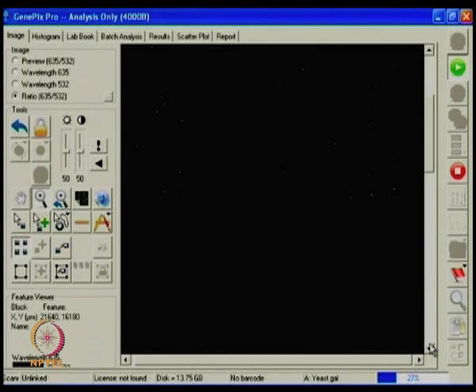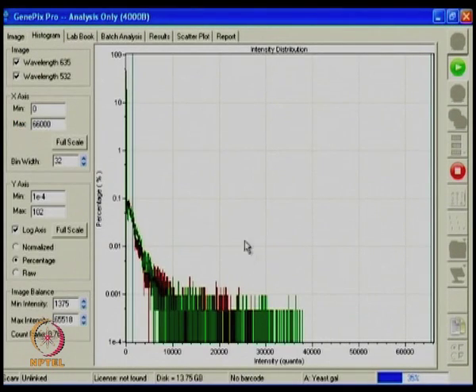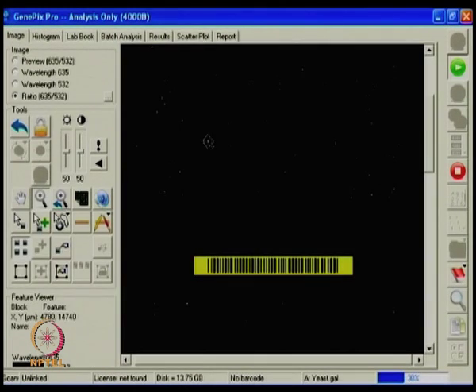Correct, to determine how well aligned the two channels are, with the help of auto PMT. So you can adjust auto PMT, you can adjust laser power, so that you can see this one. If we see some variation, then we need to come back here and adjust these parameters so that they are super aligned. Yes. So in this fashion, the image acquisition is happening.